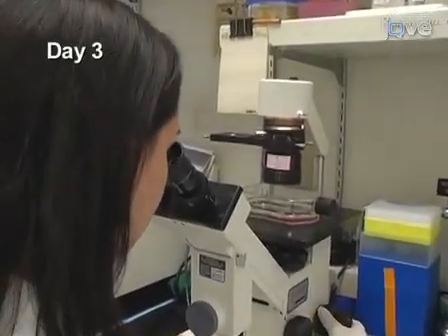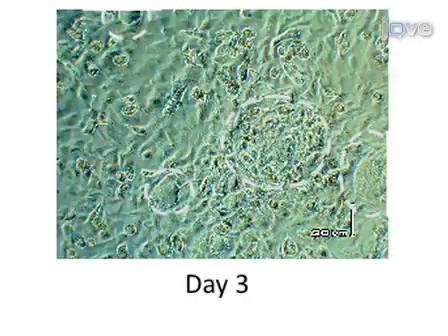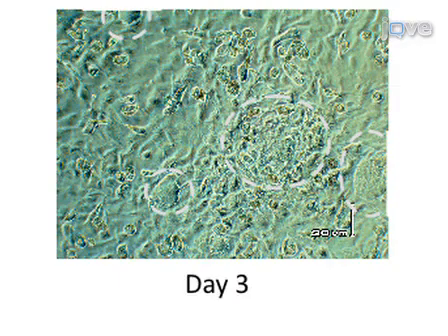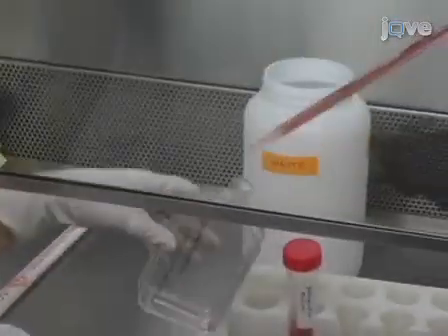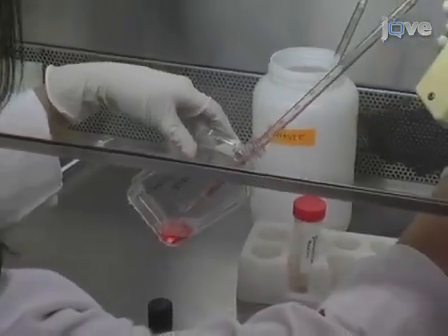Three days after the start of the ES M-strawberry OP9 co-culture, mostly large, flat clusters of ES-derived progeny with defined borders are observed, and some whorls of cells will have begun to form. Carefully remove medium from the co-culture and replace with fresh differentiation medium.